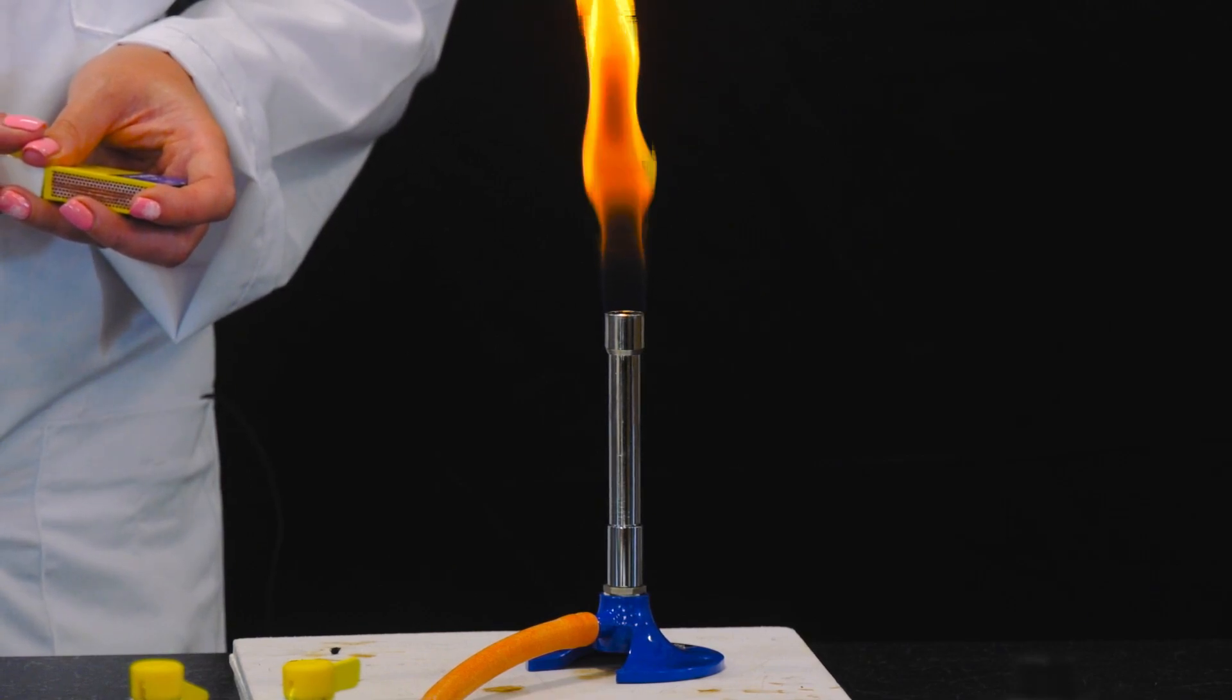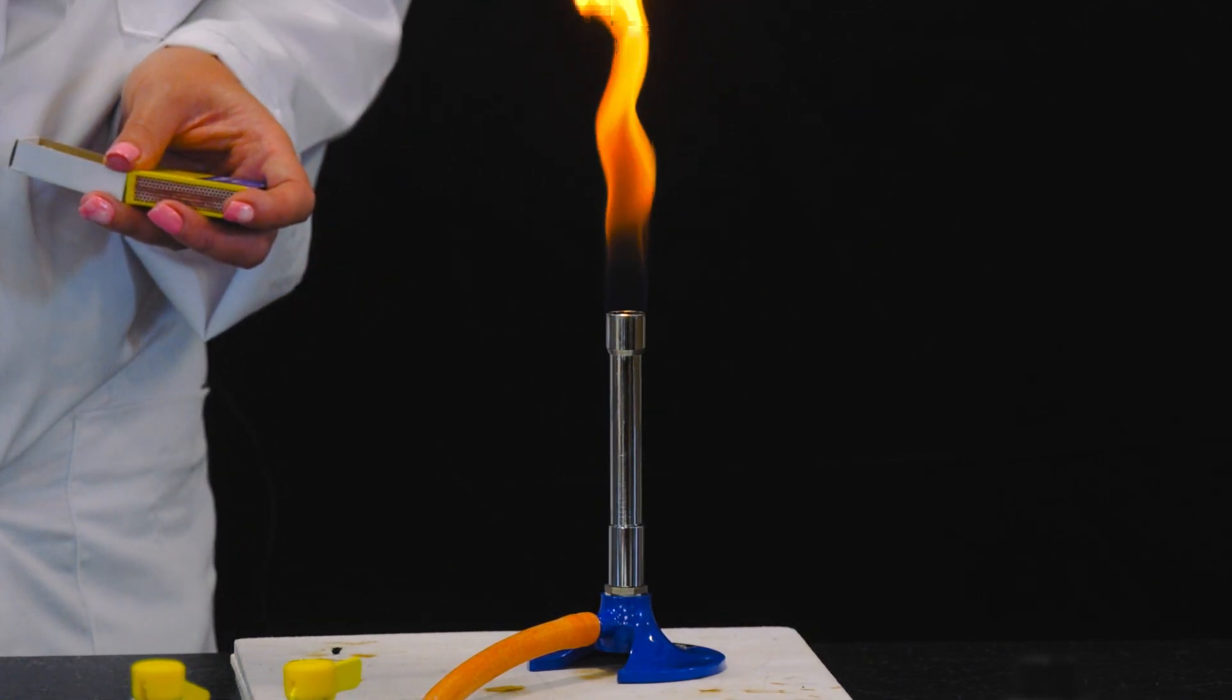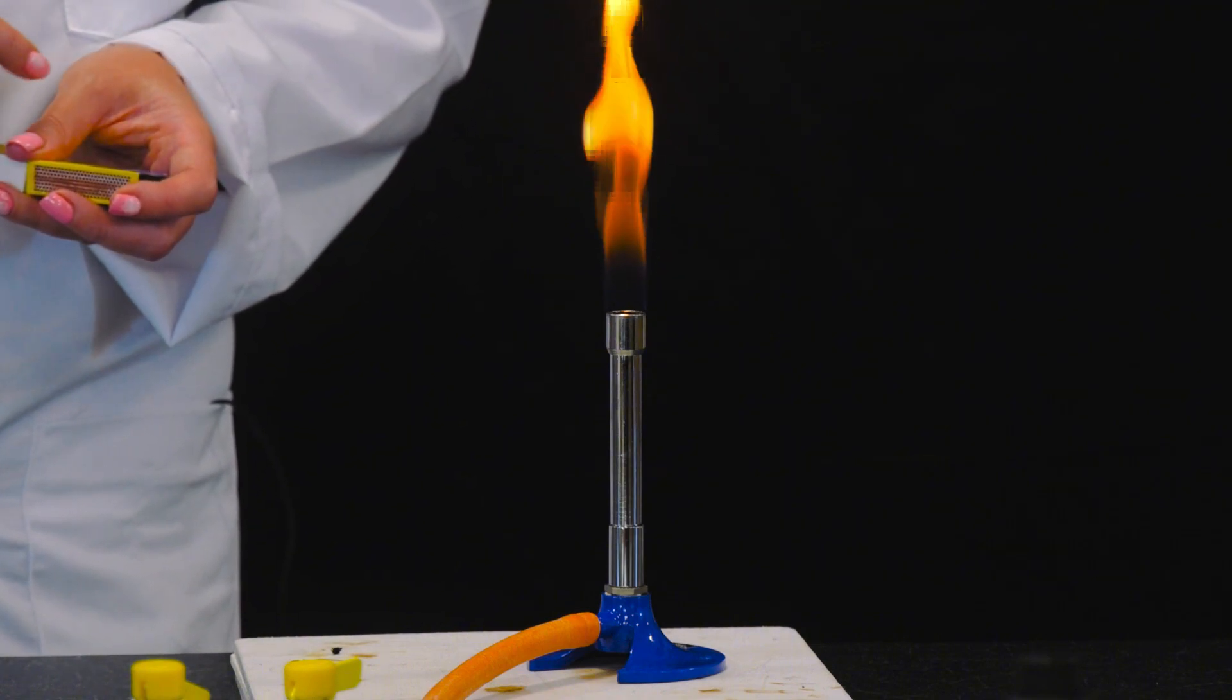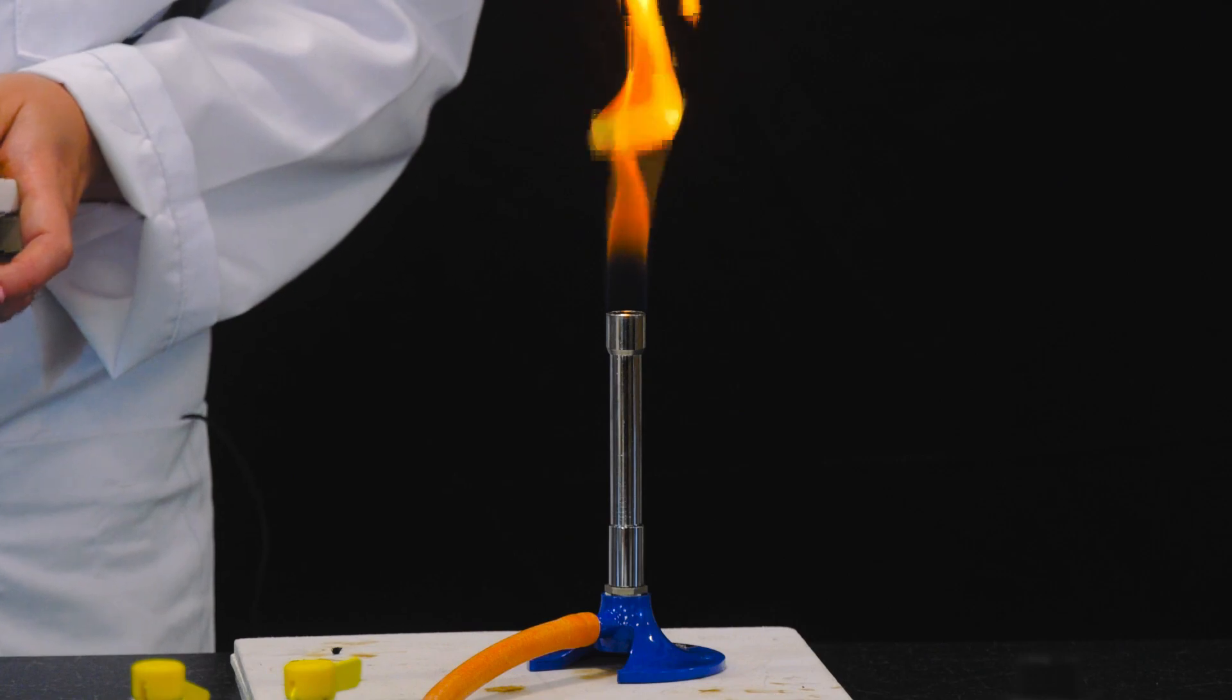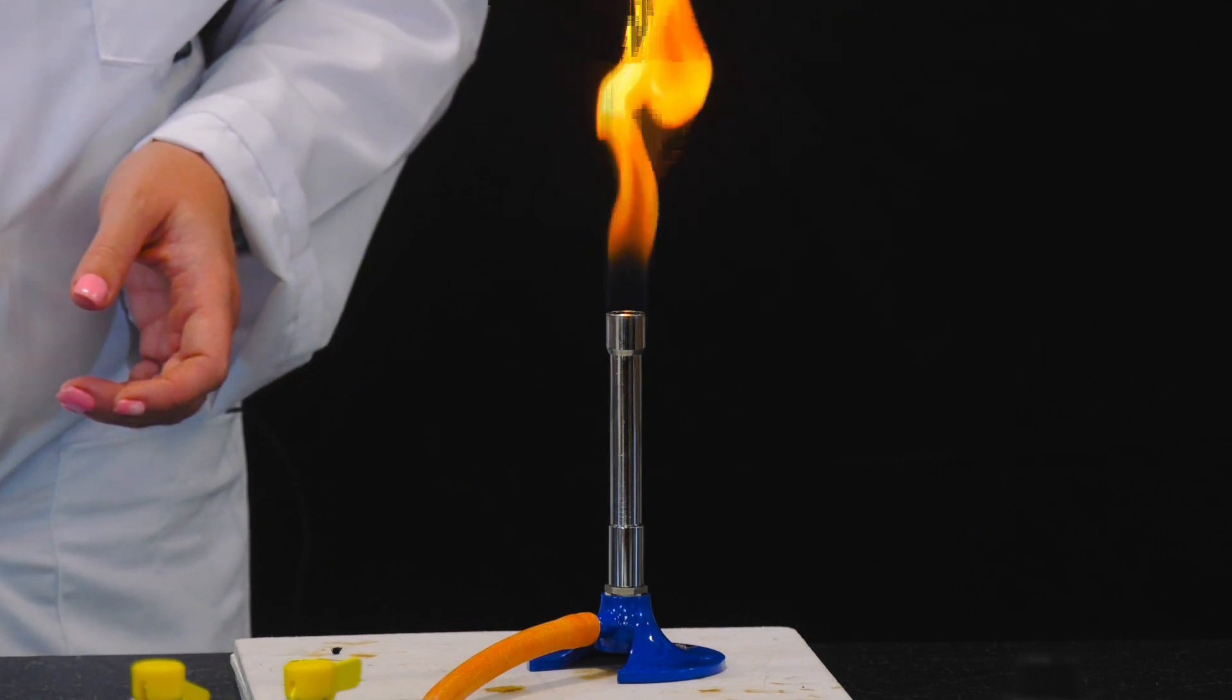You've got a yellow safety flame. This flame is cooler and more visible. To achieve a hotter blue flame, open the air hole by adjusting the collar.